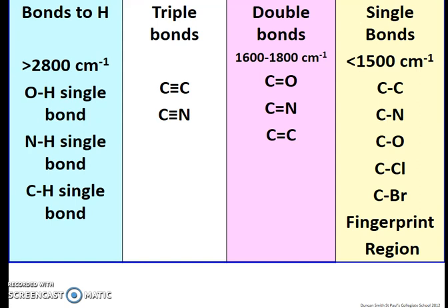That is really diagnostic, but you pretty much have to be able to compare it with a known spectrum of your compound to say for sure whether that is what it is. And that tends to be where you find your single bonds: carbon-carbon bonds, carbon-nitrogen, carbon-oxygen, carbon-chlorine, carbon-bromine, etc. We might look at a few bits and pieces in that region, but we won't look at much.